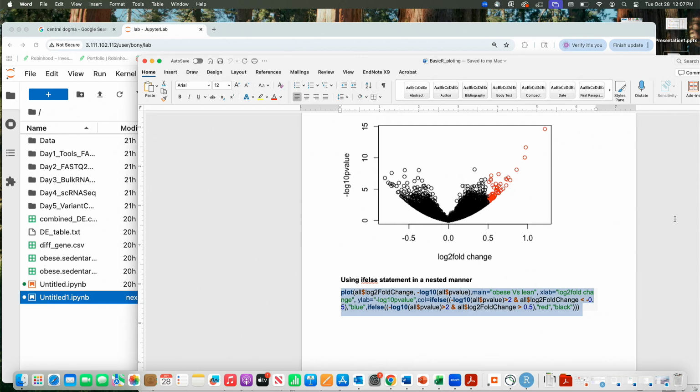But the difference between a normal plot and the volcano plot is that for a normal scatter plot, you can plot anything on an x and y axis. But technically, a volcano plot is always about log 2 fold change and the p-value, and the p-value is on a log axis. That is log 10, not the natural log. So this is something you should be aware of. The volcano plot is a very interesting tool that in most RNA-seq papers you have to make, unfortunately or fortunately, but this plot means nothing. End of the day you have to show this.